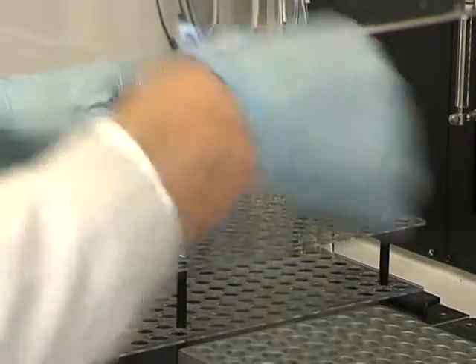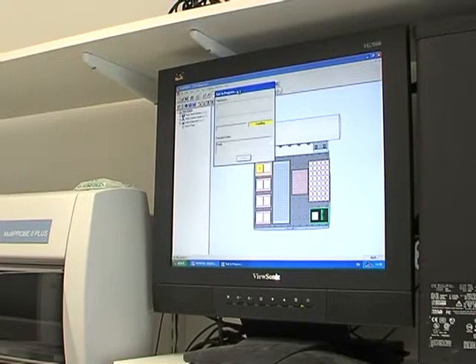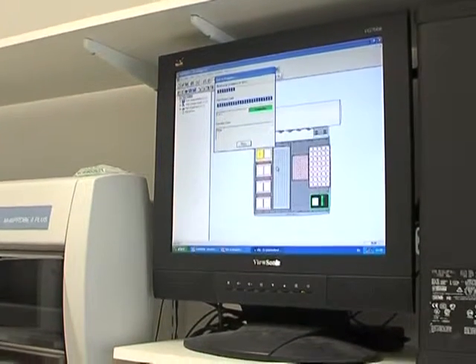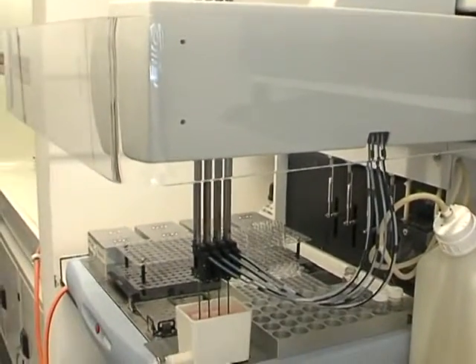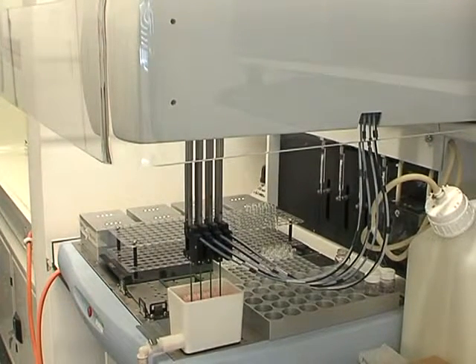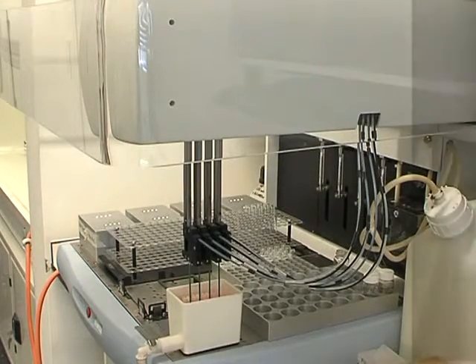The solvent selection part has been fully automated, using a liquid handling robot and HPLC or GC, allowing the selection process to be operated automatically without anyone being present. Appropriate phase systems are selected by screening a graded range of solvent systems to identify one with a suitable distribution ratio for the compound of interest.